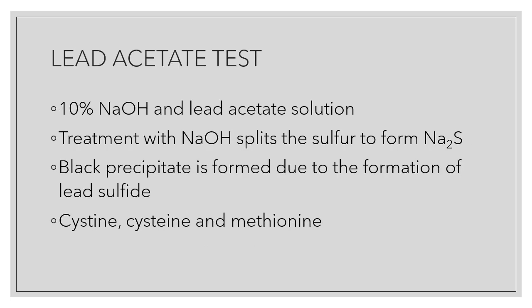The lead acetate test utilizes your 10% sodium hydroxide and your lead acetate solution.